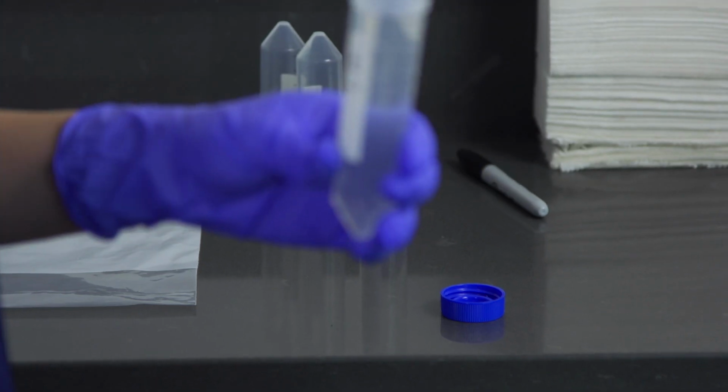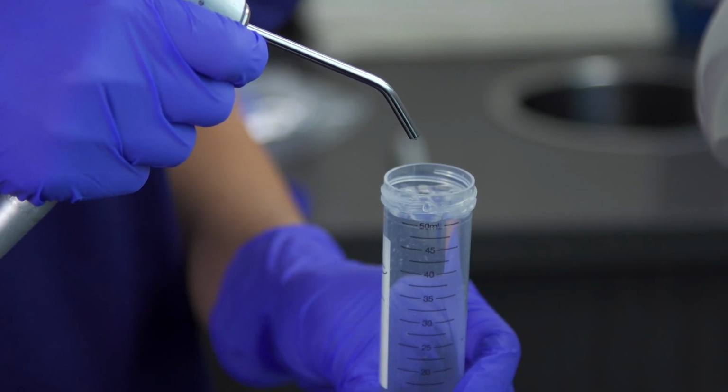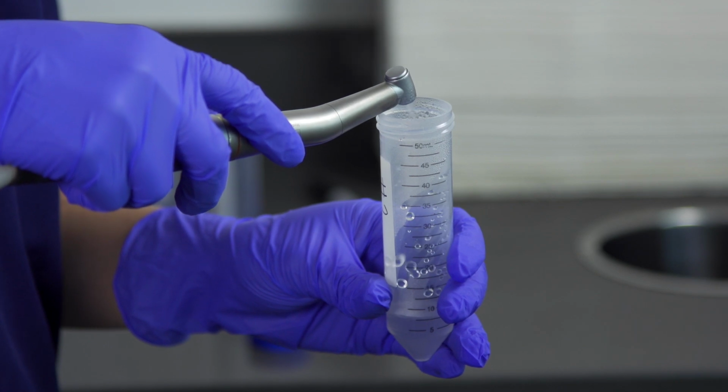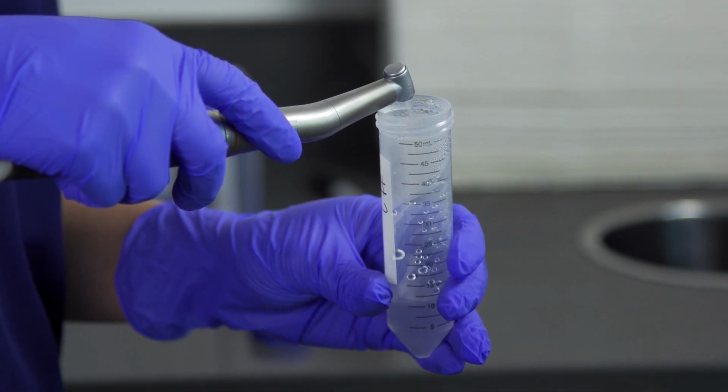Avoid cross-contamination by using sterile gloves, placing vial caps face up, and not touching the outlet tip or interior of the vial. Collect samples from each dental waterline handpiece, or a composite sample from each dental unit. A composite sample is a combination of 2 or more water sources from the same chair.